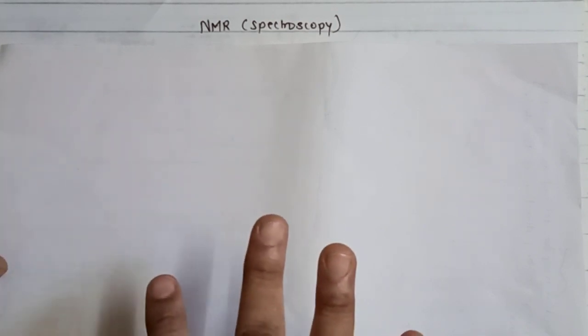because whatever sample we use in NMR spectroscopy is going to be recovered, it is not lost. So the first thing is that this technique is non-destructive, and it is very famous for identification or structure determination of organic molecules, and characterization of molecular structure. So these are the main purposes for studying NMR spectroscopy.